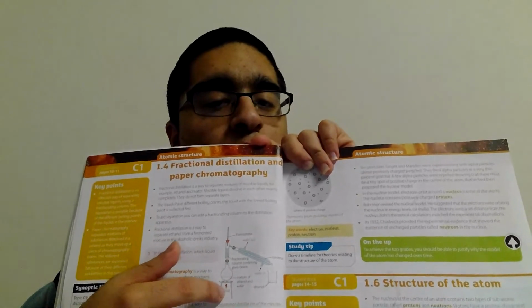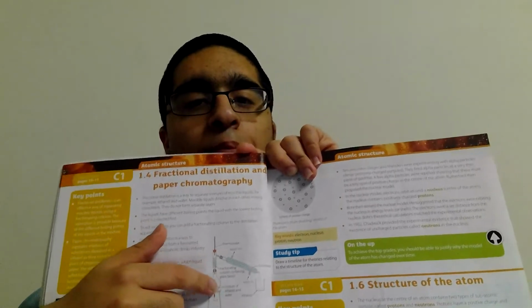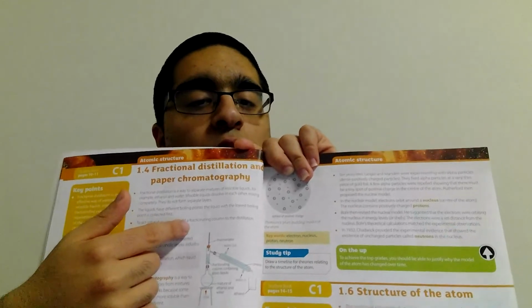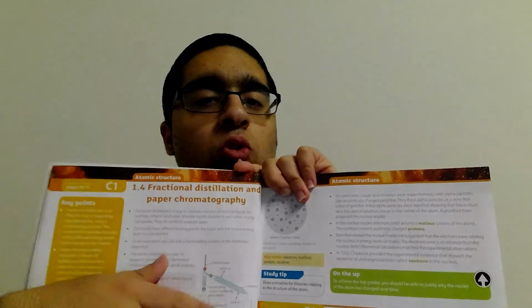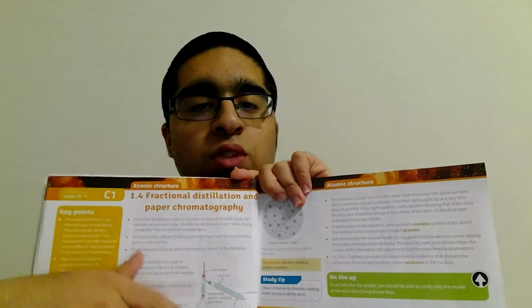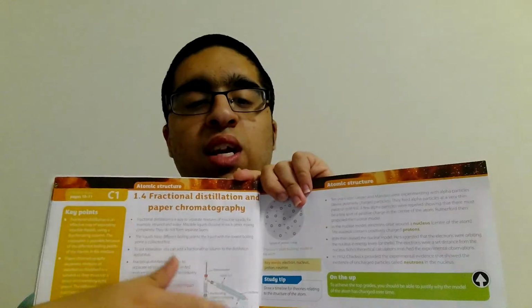The liquids go up the fractionating column, and because they're heated, they vaporize, and then they go through the condenser. The condenser has water circulating around it, which makes sure that the vapor formed from these liquids condenses back into liquid, so that it can then be collected.